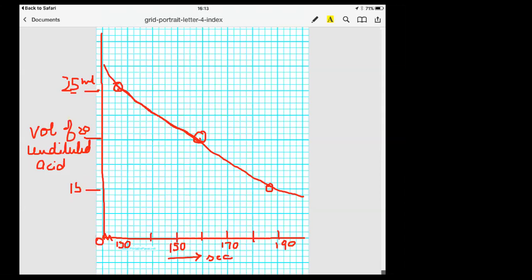As the concentration of the HCl solution is decreasing, the time taken for the same magnesium ribbon to disappear is increasing. All right. From this, you can also find out the rate of reaction. Children, one more thing I'd like to point out here. This graph that I have drawn here with the stylus hasn't come out very sharp.